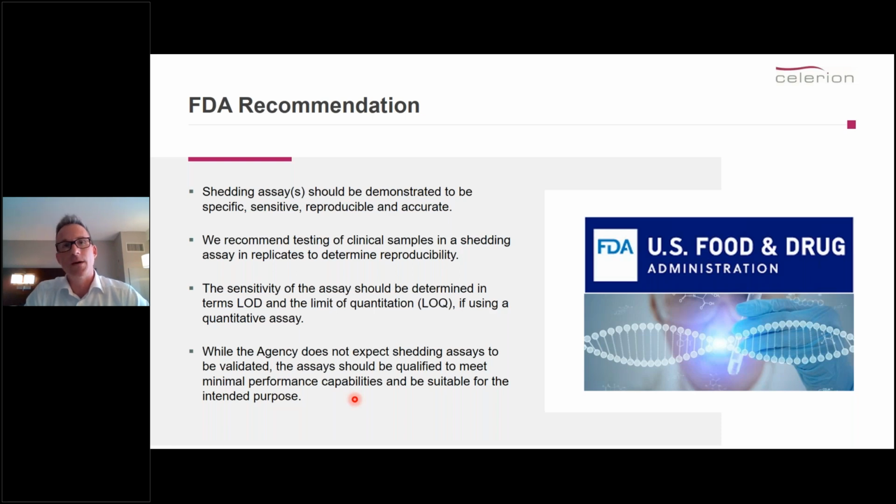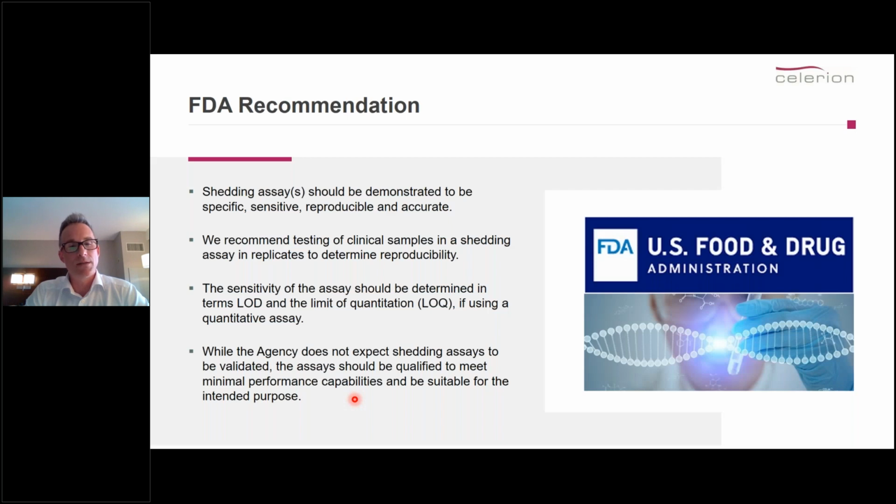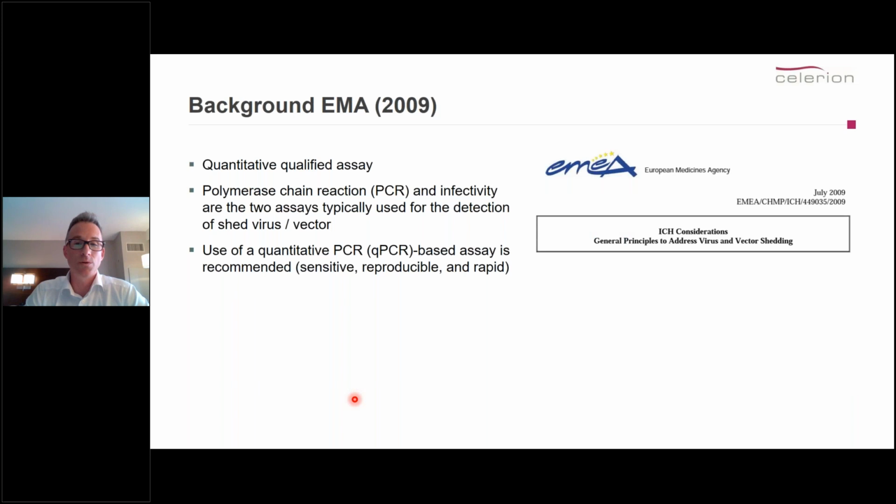for a clinical assay, where in particular the GCP really asks for and requires that all assays are validated, and particularly that you demonstrate that these are fit for purpose. And again, you need to have a fit for purpose validation approach to address this. But this is the text as it's written in the recommendation by the FDA. It was done in 2015, and maybe an updated version could come out.